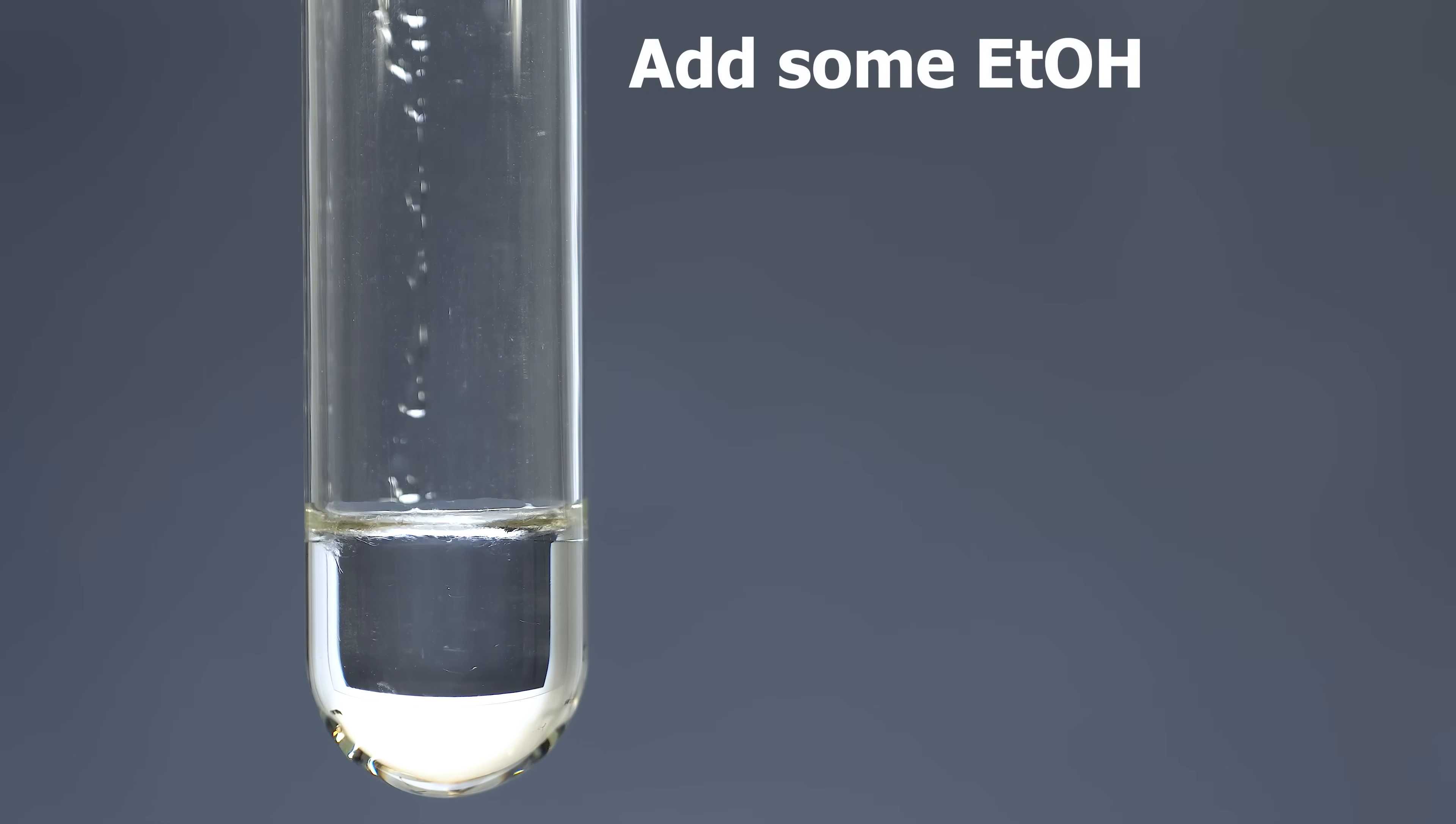To perform this experiment, we add ethanol into a test tube with concentrated sulfuric acid, and we do it rather slowly and gently. Otherwise, alcohol might mix itself with sulfuric acid, and the experiment fails.